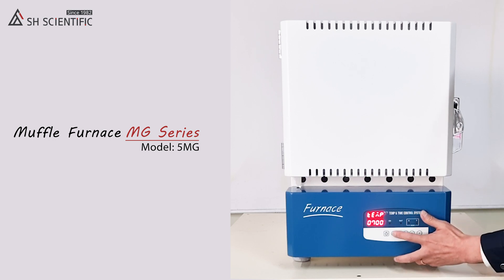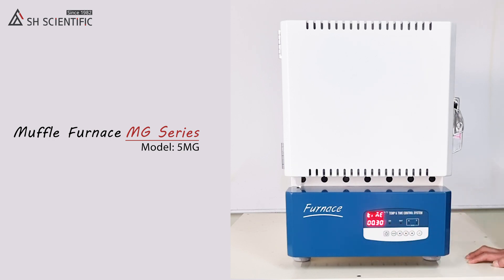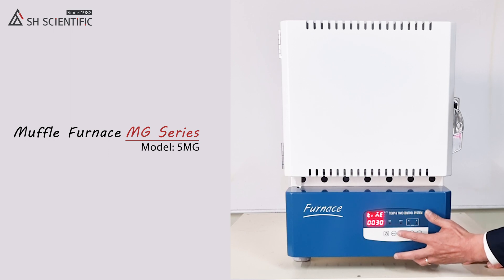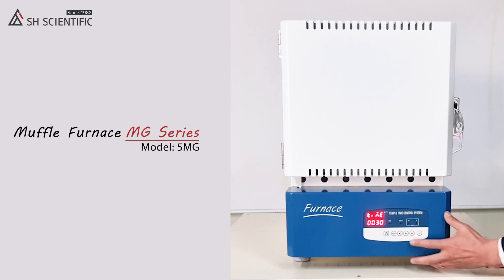Next, press the mode button twice to save your temperature and move on to time settings. Time settings tell the furnace how long to maintain the temperature we just selected — they do NOT include heating or cooling time. You can select up to 99 hours and 59 minutes in 1 minute intervals. Four zeros will set an infinite time limit, so be careful not to use that setting by accident. I am choosing 10 minutes for now.